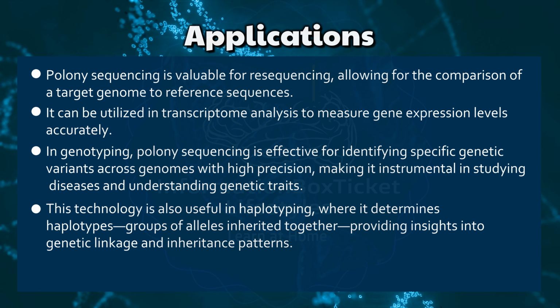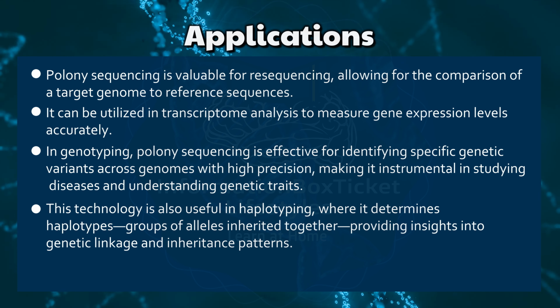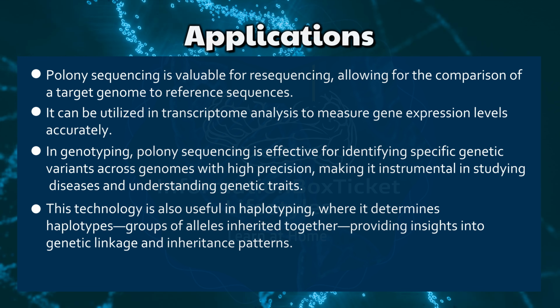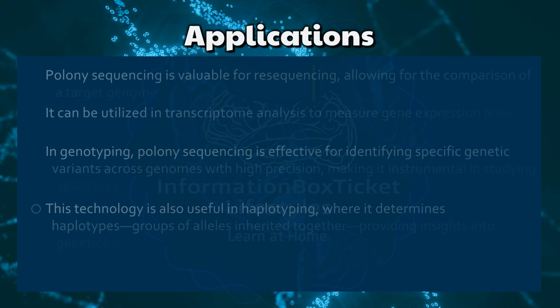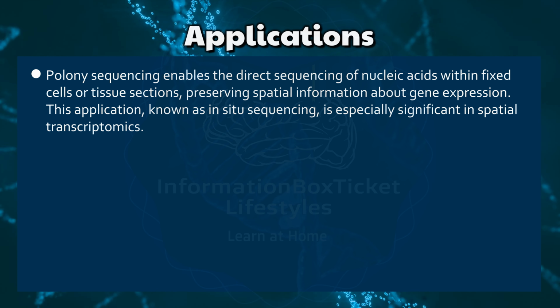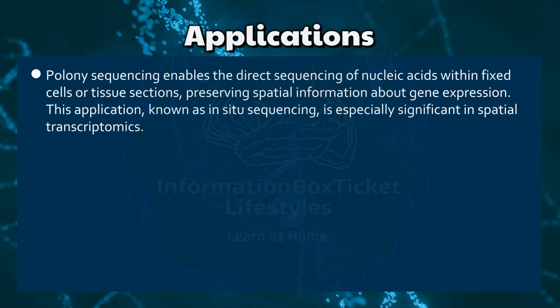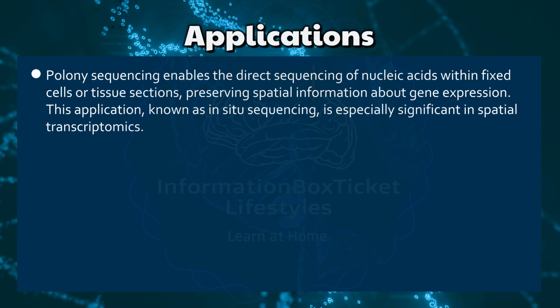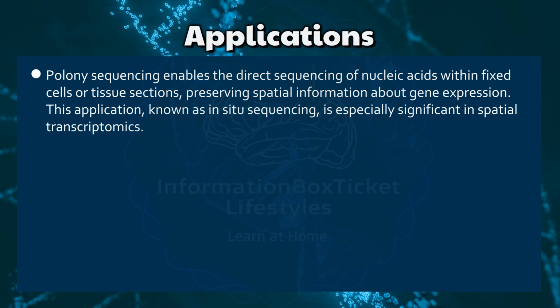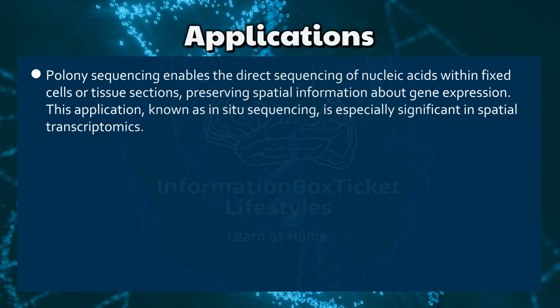This technology is also useful in haplotyping, where it determines haplotypes, groups of alleles inherited together, providing insights into genetic linkage and inheritance patterns. Polony sequencing enables the direct sequencing of nucleic acids within fixed cells or tissue sections, preserving spatial information about gene expression. This application, known as in situ sequencing, is especially significant in spatial transcriptomics.